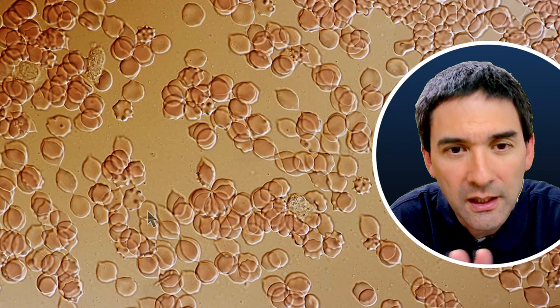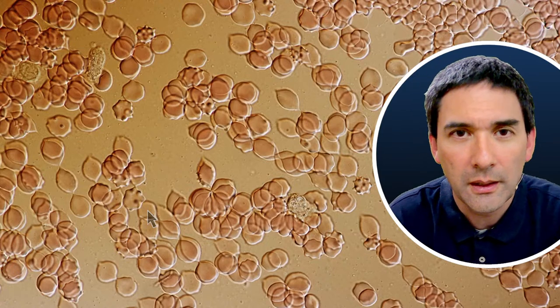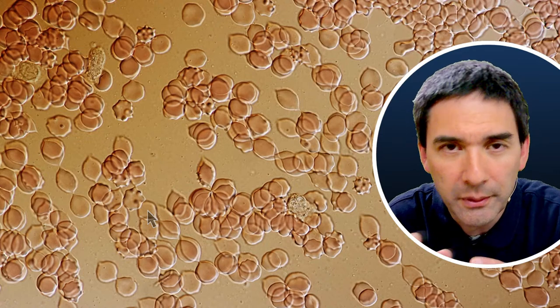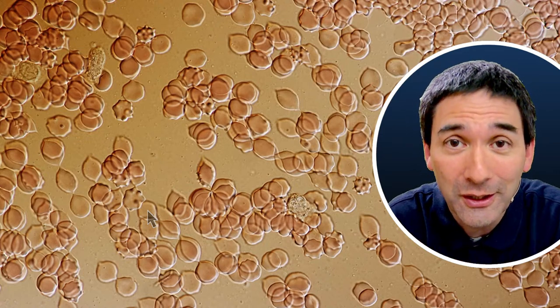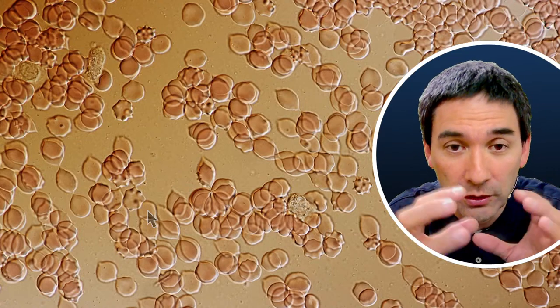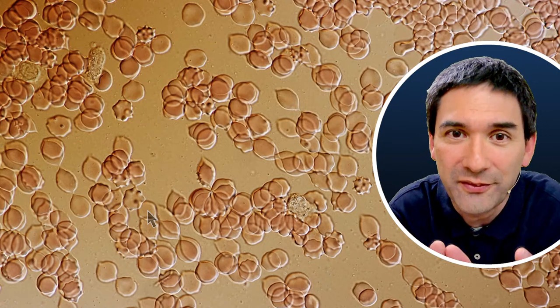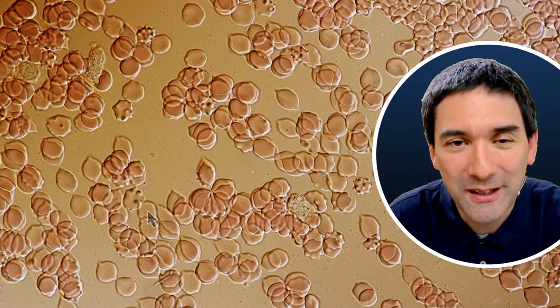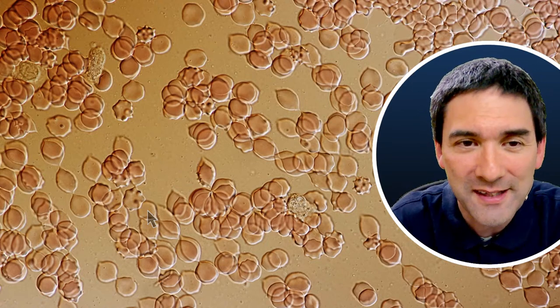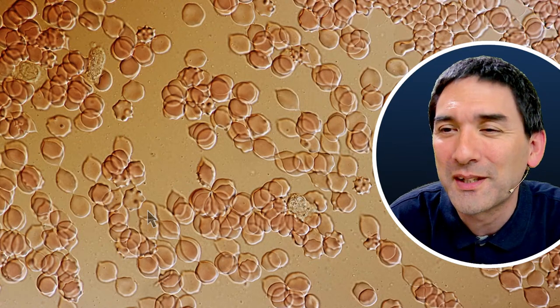You see that at the beginning the red blood cells all look the same, and then as the blood sample starts to dry up, you see different phenomena happening. The red blood cells start to shrivel up, and especially when you add a little bit of salt to the specimen, the red blood cells really lose a lot of water, and all of them start to become deformed. If you add distilled water, they're going to swell up and become completely spherical. So you can change the shape of the red blood cells by controlling the salt concentration. Quite fascinating to observe this. Just some suggestions if you want to try something out.